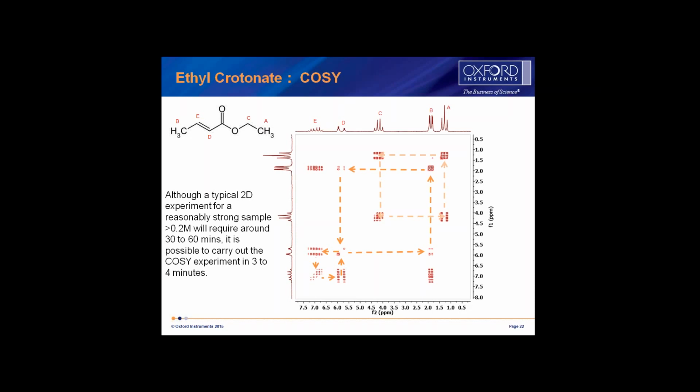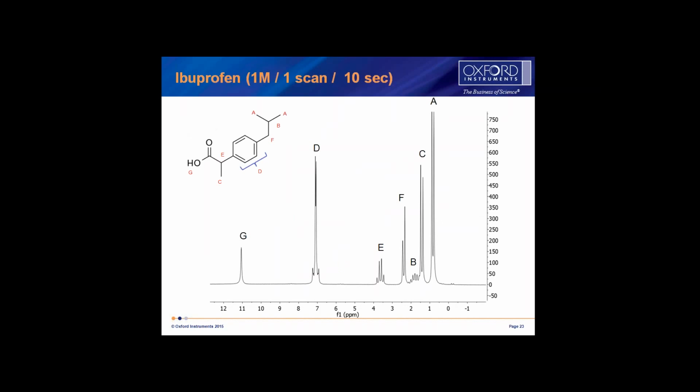Although 2D experiments for a reasonably strong sample, typically 0.2 molar and better, will require between 30 and 60 minutes, it is possible to carry out the COSY in 3 to 4 minutes. And to do that, we'll take a sample of ibuprofen.